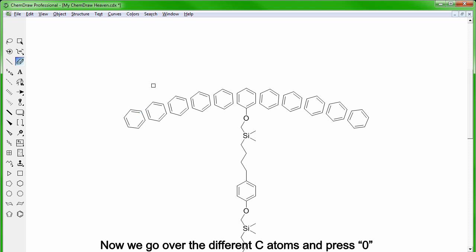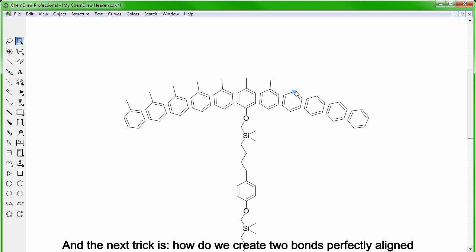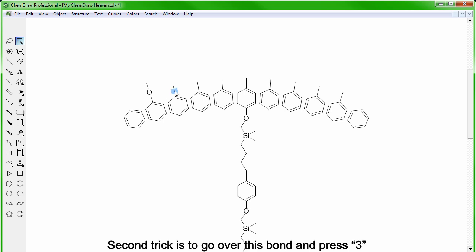Now we can go over the different carbon atoms and press 0 to get additional CC bonds. And the next trick is how do we create two bonds perfectly aligned no matter their orientation? First trick is go over one atom and press 8. What that will do is sprout three CC bonds at a 90 degrees angle relative to each other so that you can delete the two that you don't need and then simply press O to get the oxygen. Second trick is go over this bond and press 3 to get a triple bond. I know it doesn't look very nice, but it will disappear soon. Once there is a triple bond you can go over the carbon atom and press 0 which will sprout a CC bond at the expected 180 degrees angle. Then we simply switch back to a single bond by pressing 1 over the triple bond and then you add the oxygen by pressing O.